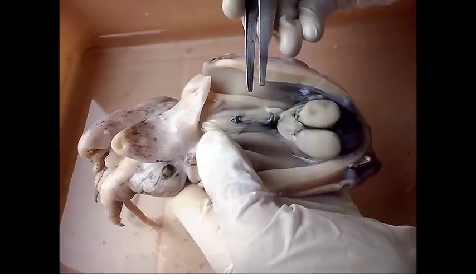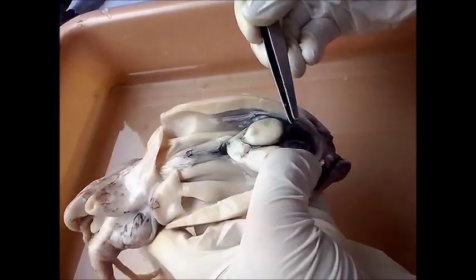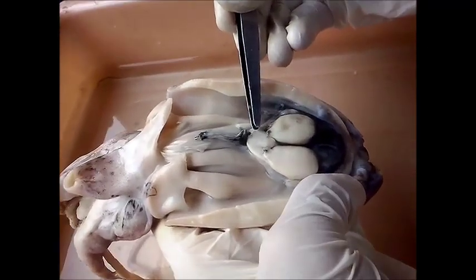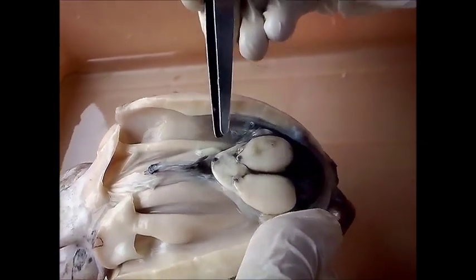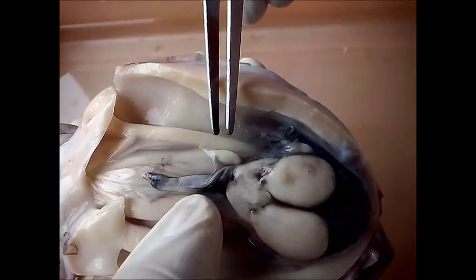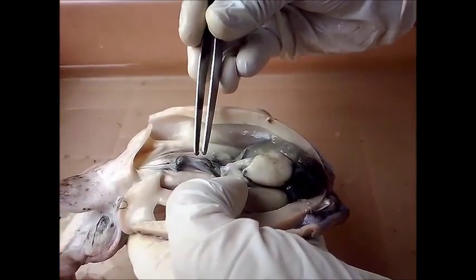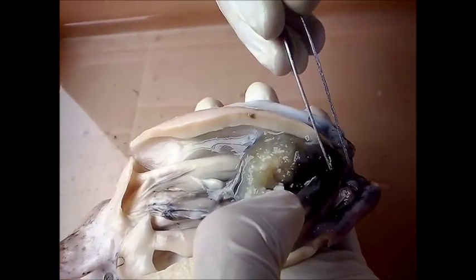After discarding the parts of the viscera that we do not need, this is what we see: a pair of nidomental glands, attached to which on top are the accessory nidomental glands. What is also seen is the oviduct and the female genital opening. In order to see the ovary which contains the eggs, we will have to remove the ink sac. We must be extremely careful while removing the membrane present in between the ink sac and the ovary, to avoid the rupturing of the ovary.